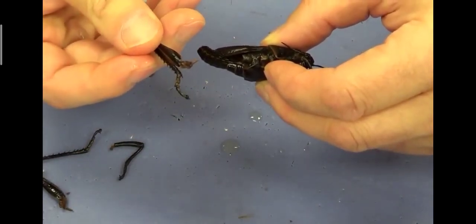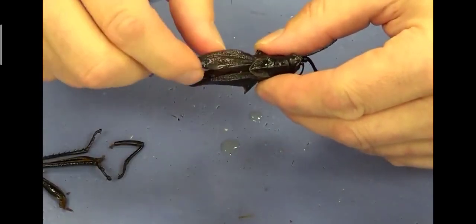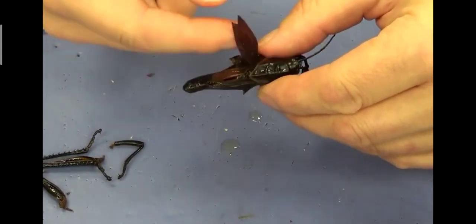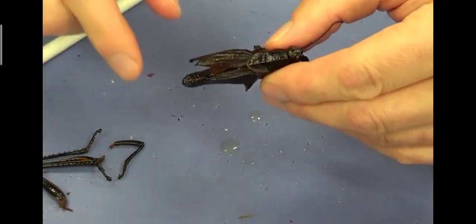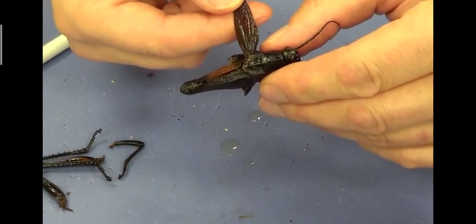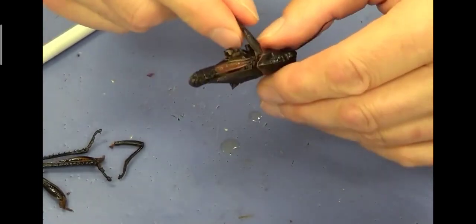Now you can observe the segmented part of the body. Now the wings come out from the mesothorax. The outer wing, that is the forewing, is termed the hard one, and these appendages help the grasshopper to fly. So this one is a little bit leathery in structure and quite hard.